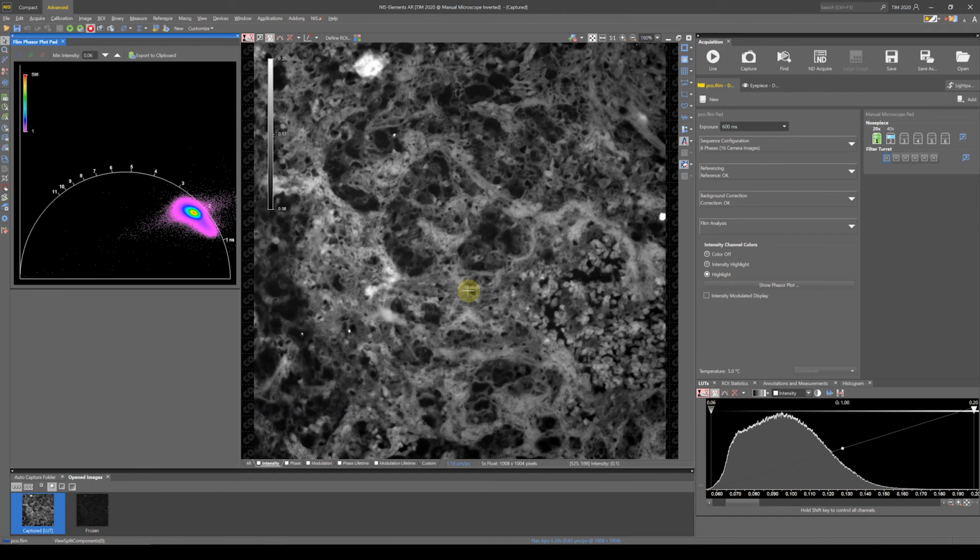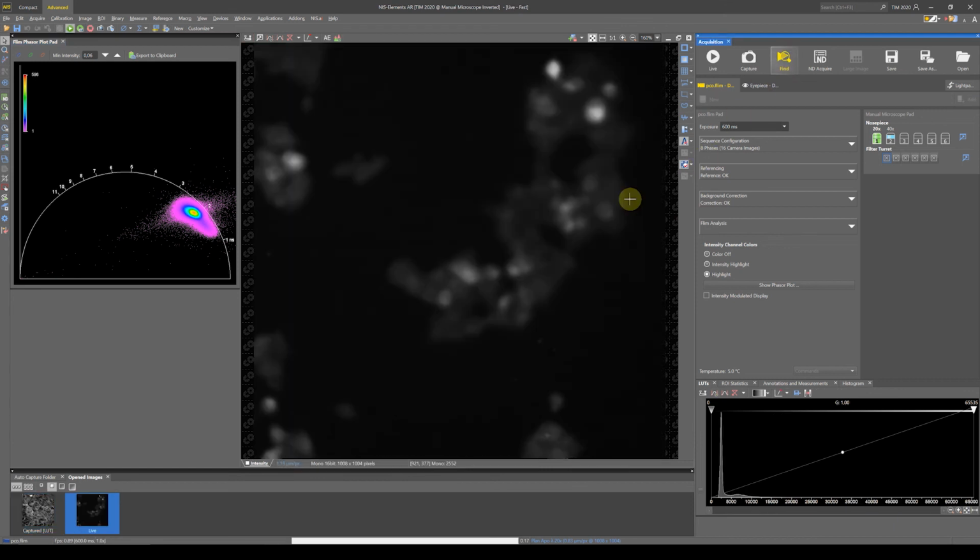But it's also possible to switch to a different slide to focus on a different sample. Have a look to the focus. Adjust the focus. Here we are in a range of more or less single cells. And do a capture.